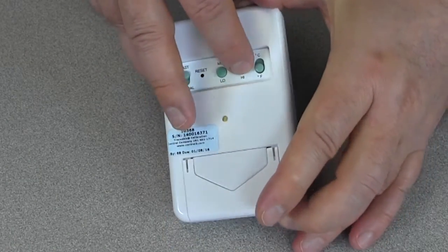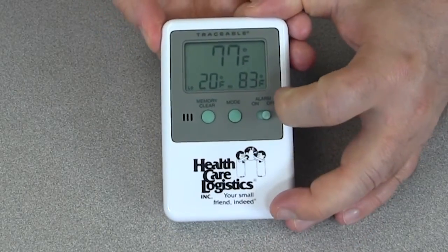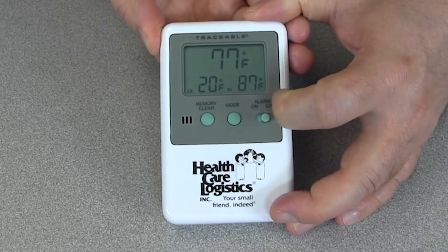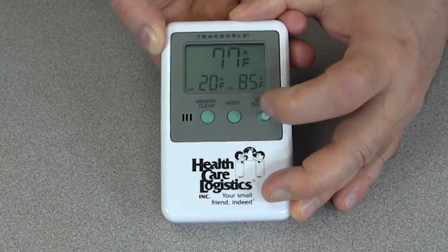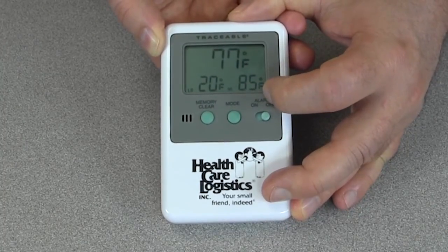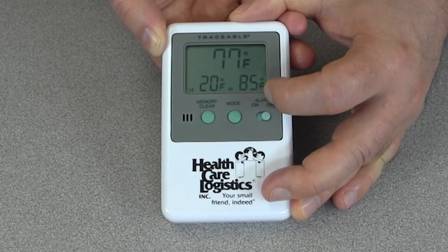To adjust the high temperature alarm settings you simply follow the same procedure for setting the low temperature. You will now see that our low alarm setting is set at 20 degrees Fahrenheit and our high alarm setting is set at 85 degrees Fahrenheit.